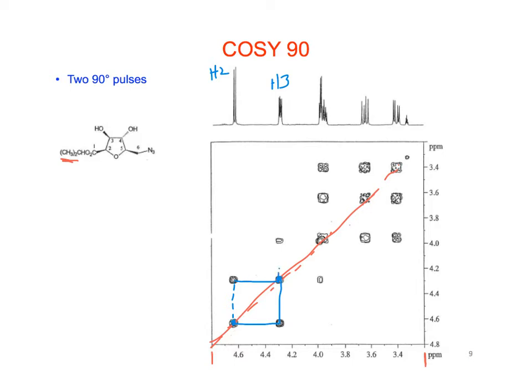So then we go to the next one. We can go either vertically or horizontally. We go across. Notice that this next signal has 2 signals in it. It has one that's taller and then a smaller one right here.